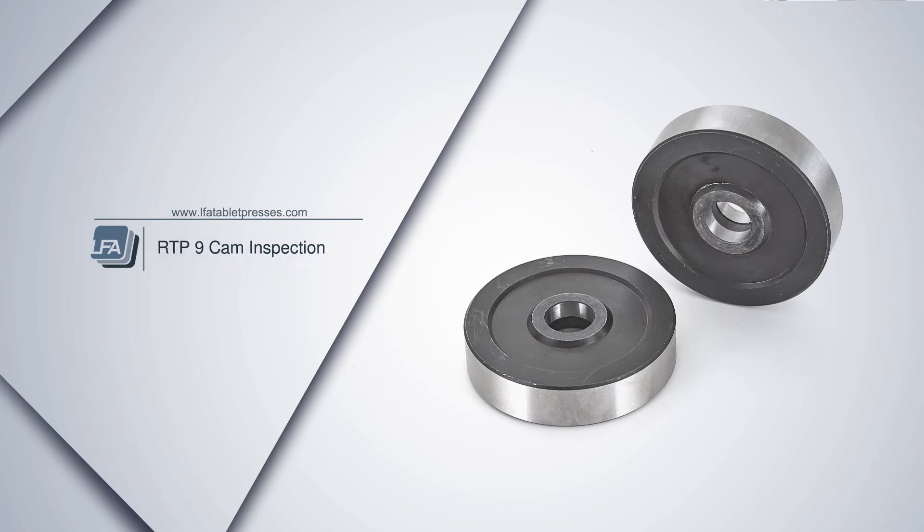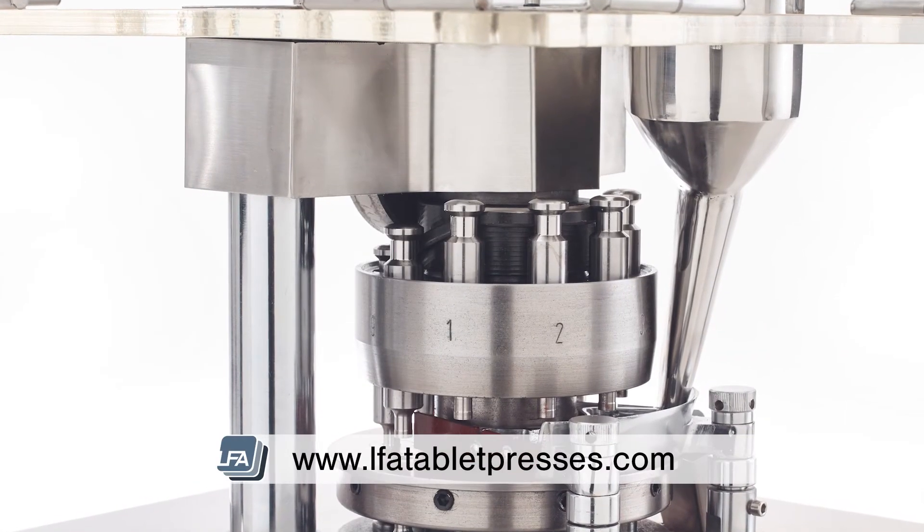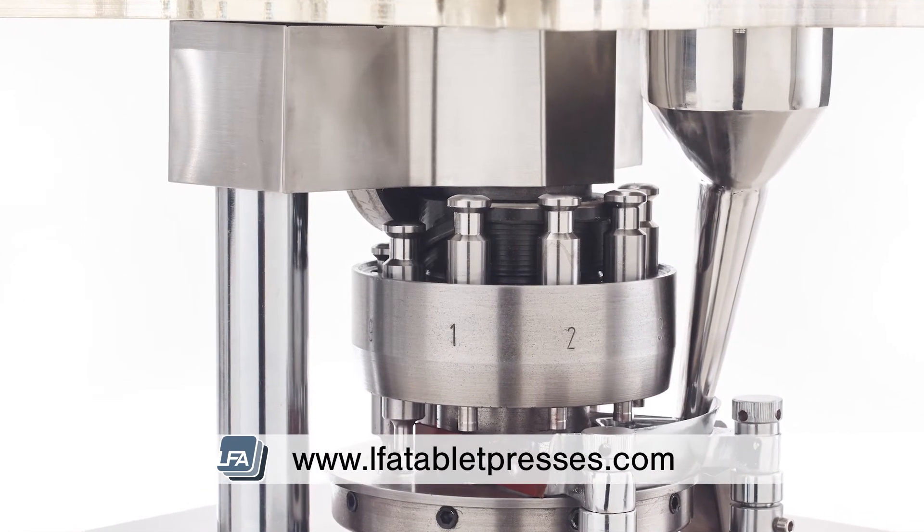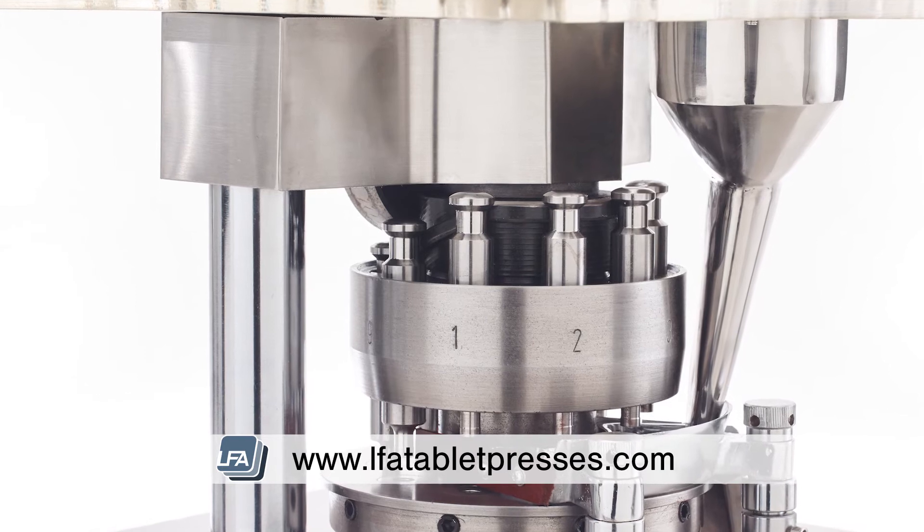Welcome to LFA's video on inspecting your RTP9 roller cams. Over time your roller cams will wear down, so it's important to spot when they need changing. The cams are what come into direct contact with the heads of the punches.